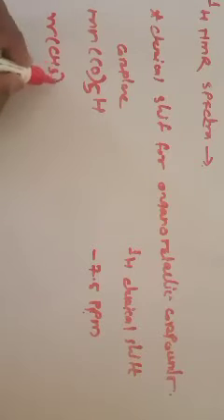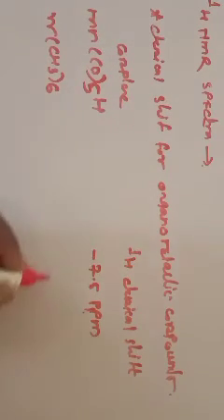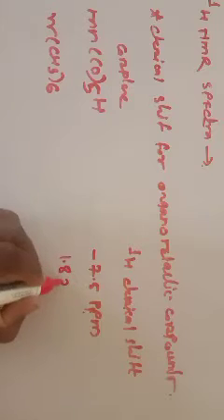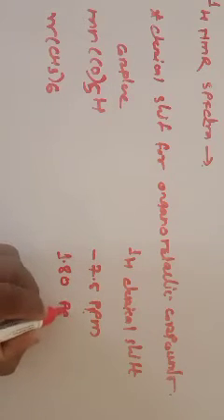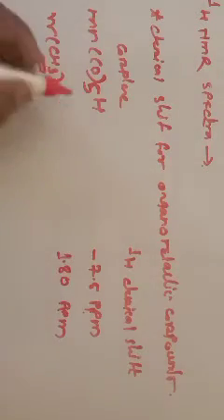Second, that is WCH3 by 6, where the tungsten metal is there, and 6 methyl groups are there. If you consider its H1 chemical shift value, it is 1.80 ppm. So we are considering this proton, that is the methyl proton. So this is the value.